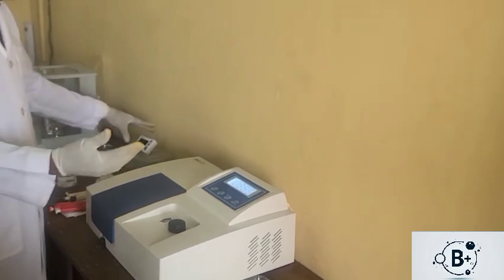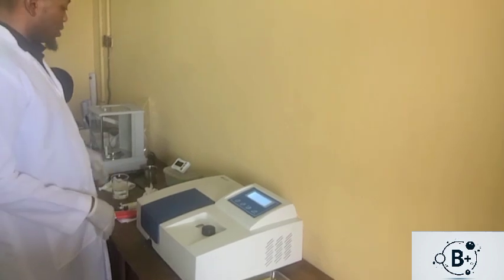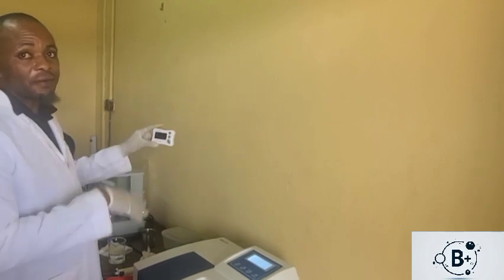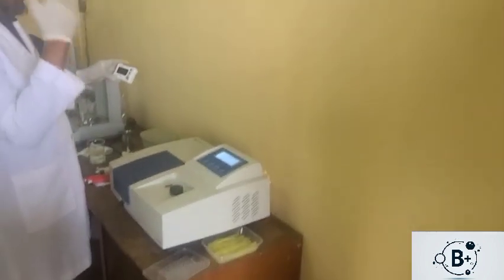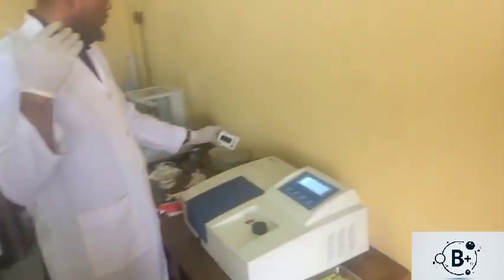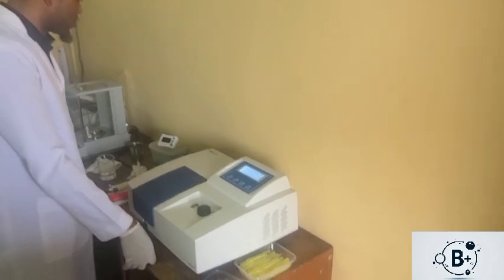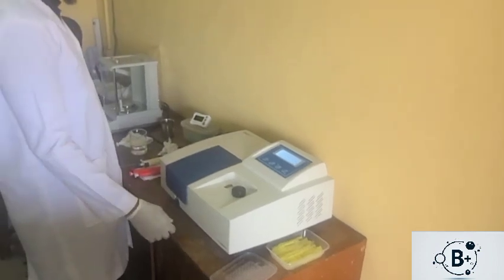So we have 864 as the initial reading from here. 864 at 0 seconds. Then the timer will help us with the interval. So we'll be able to know when we are having the first 60, then the second 60, the third 60. So from 0 to 60 seconds, from 60 seconds to 120 seconds, from 120 seconds to 180 seconds. That's what we're looking at.